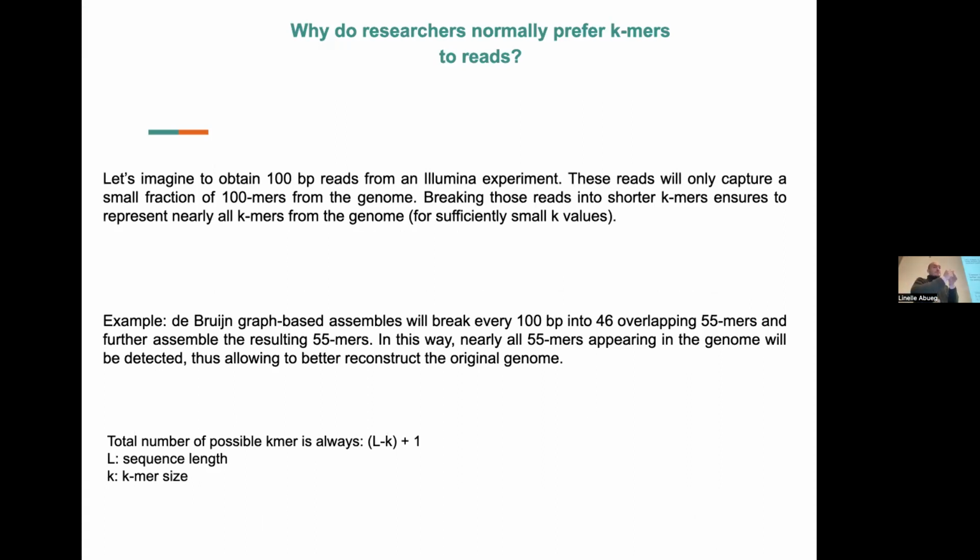You didn't have a lot of flexibility, because if you were to break the sequence into its constituent k-mers, then you could find those k-mers in other reads. But if you were to try to find overlaps directly between the reads, then if there is even a single error between one read and the other, you will not be able to find a perfect overlap. Whereas with the k-mers, you could avoid that.